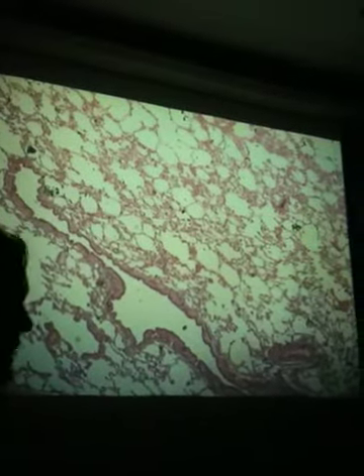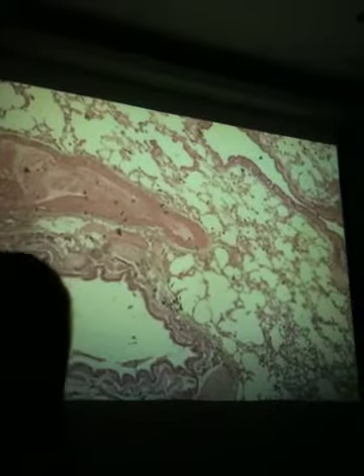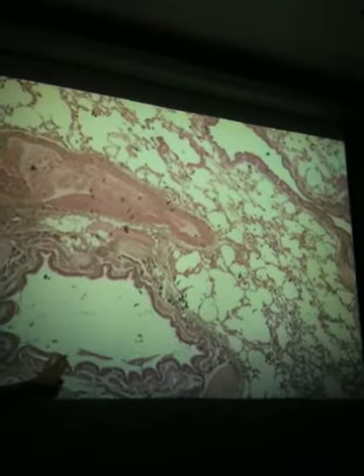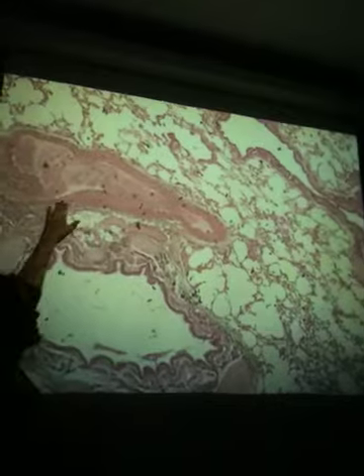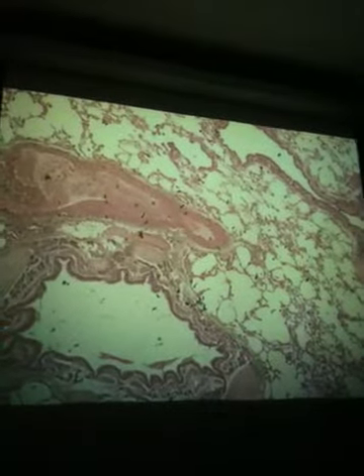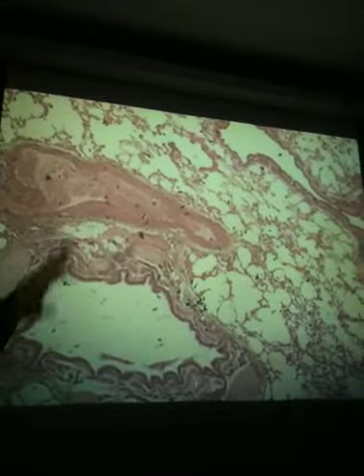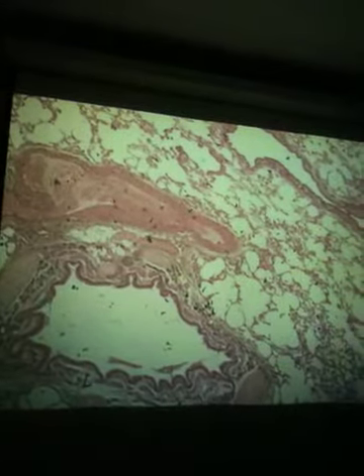The thing that complicates it is that in addition to the tubes that would be the bronchi and the bronchioles, you also have to be able to find the arteries and the veins. Notice the difference in this slide — we can see these thick internal layers, which represent either a bronchi or bronchiole, versus the arteries where the media is thicker. And often the arteries and veins will have blood inside them, so instead of seeming clear, they'll be pinky inside. If you see that, that's a dead giveaway that you're looking at either a pulmonary artery or a pulmonary vein.